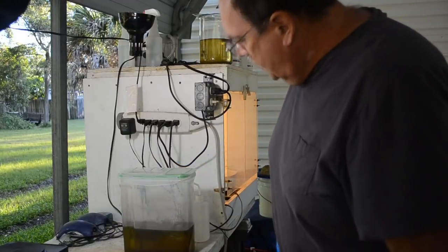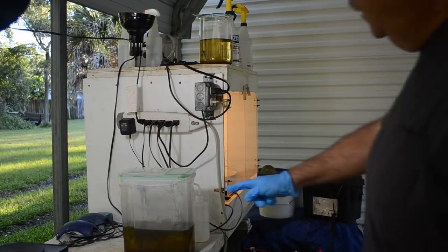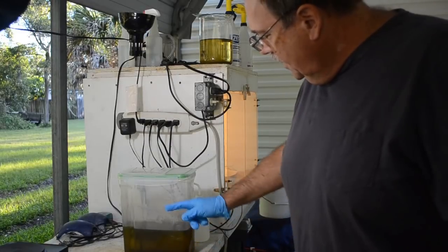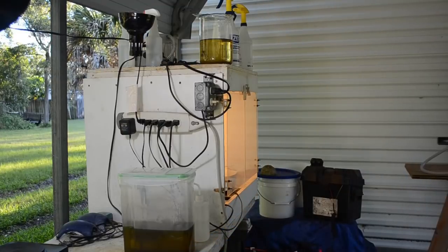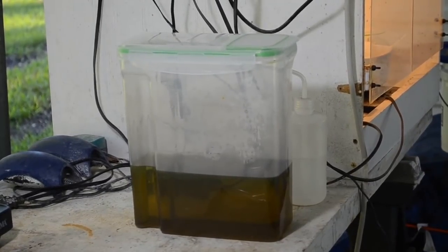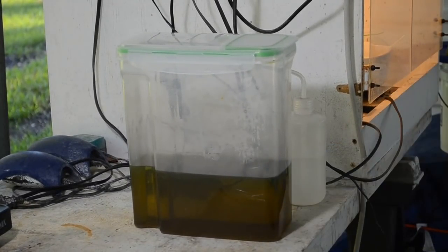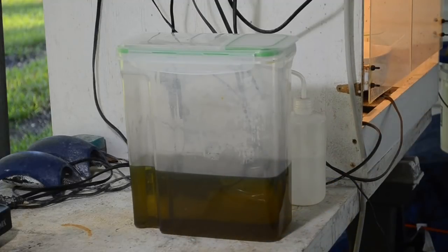Now, a couple weird things going on with the temporary stock pot here. This has got the liquid in it from the first gold drop. This was empty. I had cleaned this out. So all the liquid in here is from the first gold drop. Let me see if I can give you a close-up of it. It has re-stratified again. Brown at the bottom, green at the top, just like it was when it was in the beaker. And there's also a light film of gold on the bottom of it. So more gold has come out of solution while it's sitting in there.